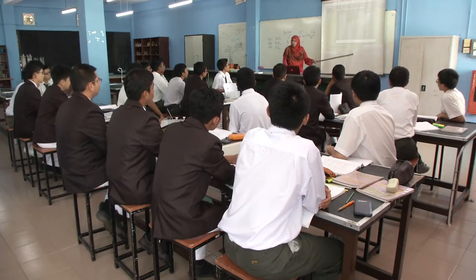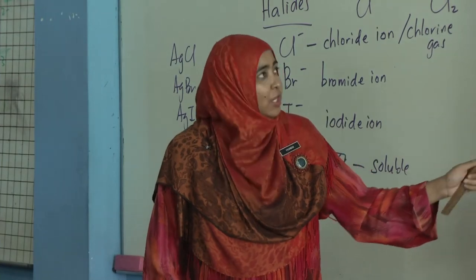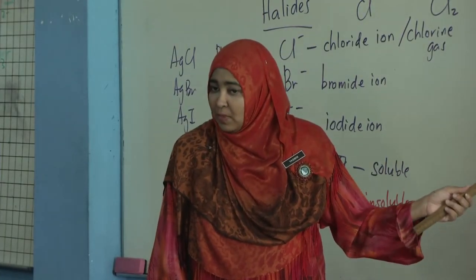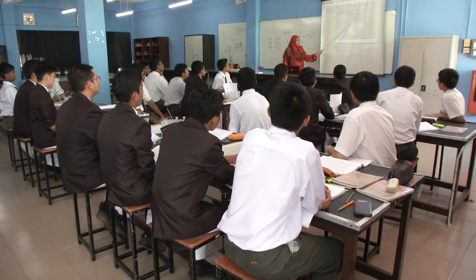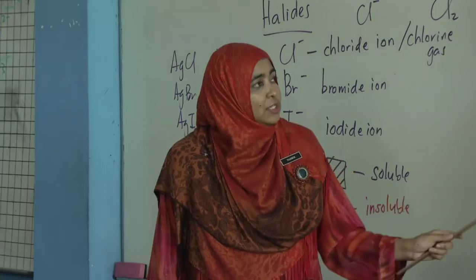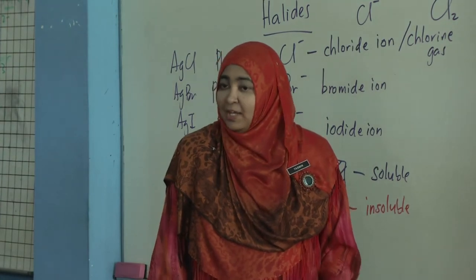You stir before. Now, you're using it to avoid spillage, because we don't want the salt solution to spill from the filter funnel. Until here, clear? Good. Now, we have to leave it for gravity to do its job. So this is the next process, which we will do in your next class. Any questions so far?